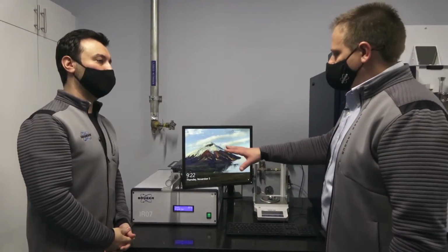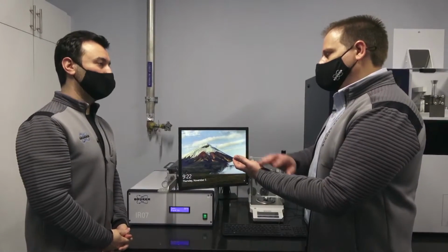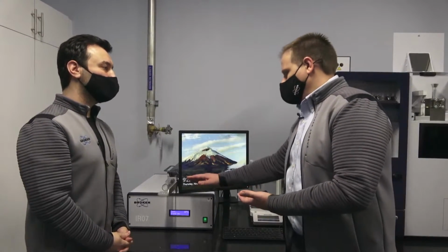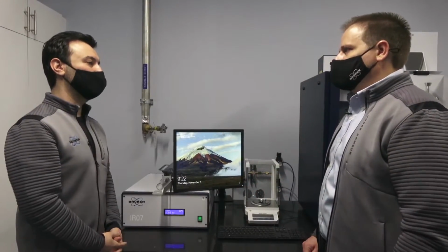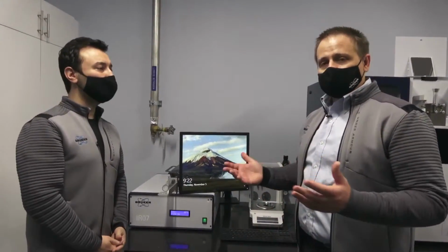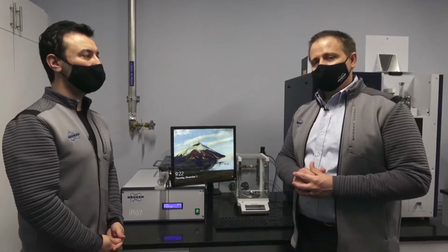So having access to a machine like this is important because then we can create a test specimen while we're welding the major part, run right over to the lab, stick it in, and then know we're good to go. It's crucial. Okay, so that was a really nice overview of these different techniques. What we're going to do now is head back to the studio and answer some of the questions that have come in.